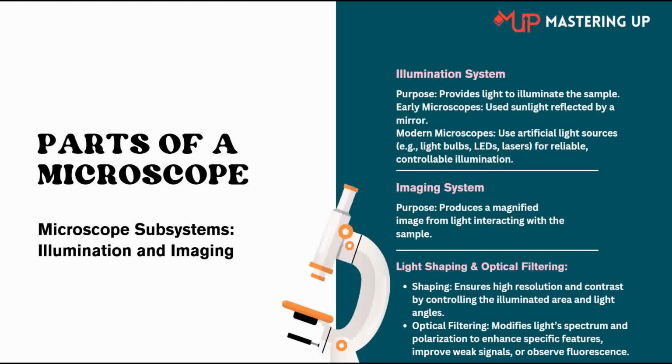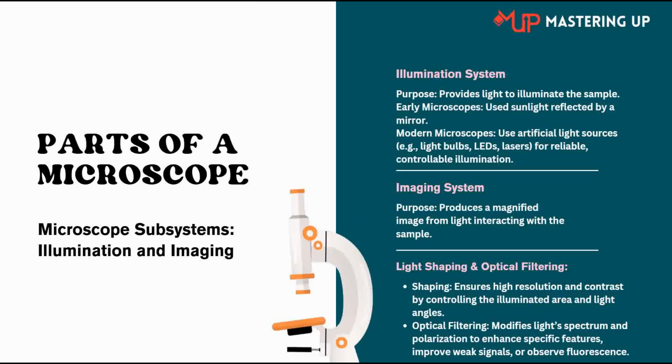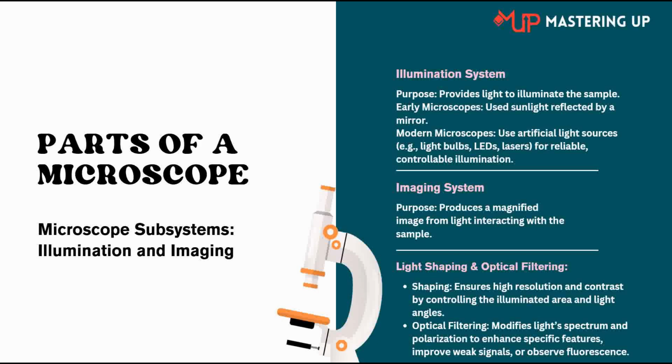In modern microscopes, we use artificial light sources such as light bulbs, LEDs, and lasers for reliable and controllable illumination. Now the imaging system produces a magnified image from the light interacting with the sample.